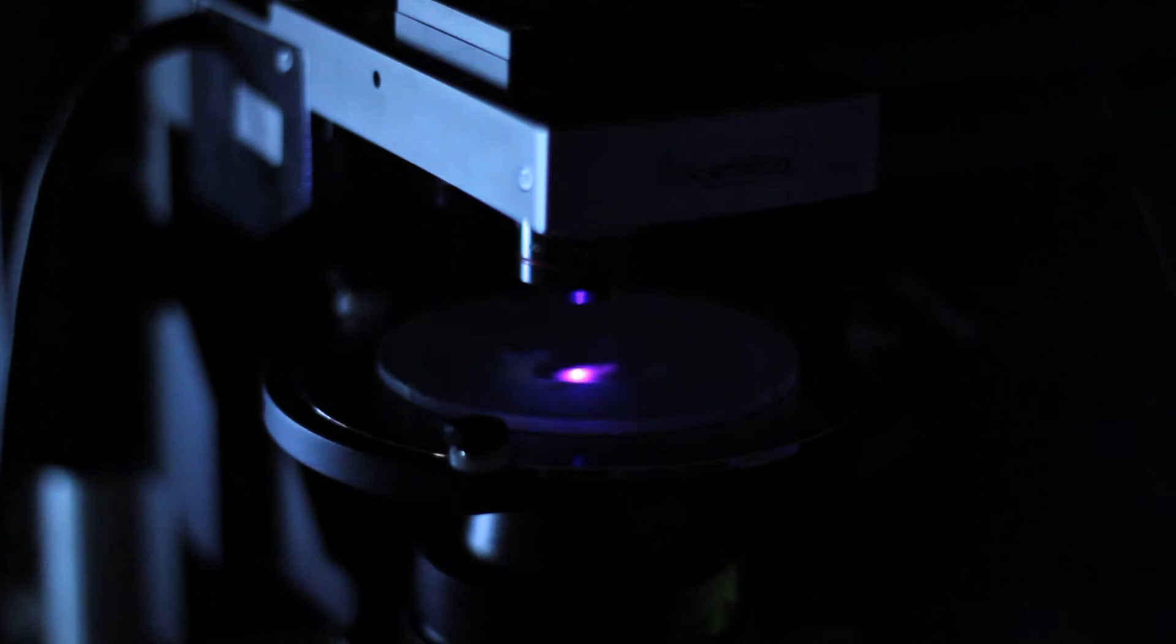It retains a small footprint to help make the most of your lab space. The laser can be launched into the scope by either fiber coupling or free space optics and will fit onto most standard anti-vibration tables.